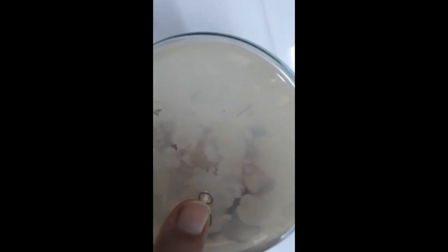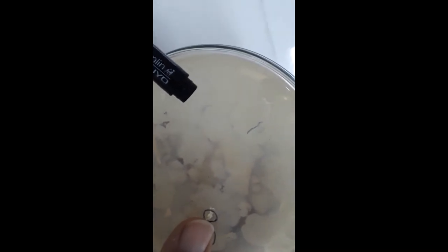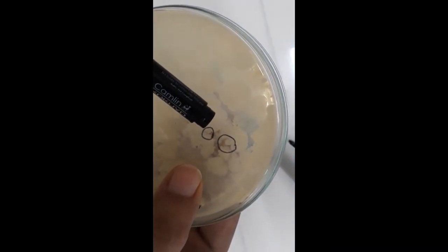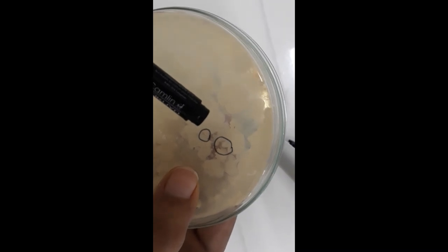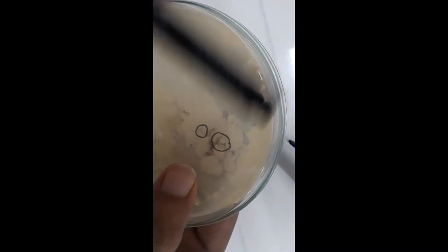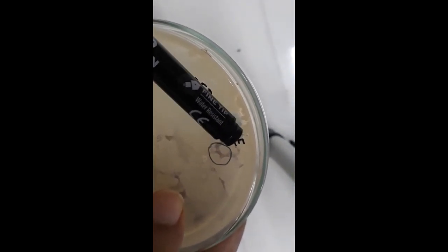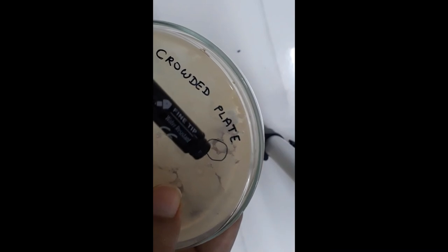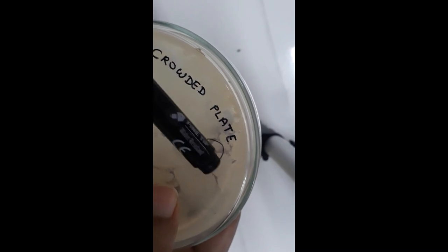If we look at the plate, at this area there is no antibiotic producer, so therefore there is no halo seen. But here we can see this tiny colony is pushing all other microorganisms away from it and therefore we can see a smaller halo around it. A bigger halo can be seen here and the biggest is seen here where the central colony is producing so much antibiotic substance that so many organisms are being pushed back because they are getting killed when they come into this zone of clearance.